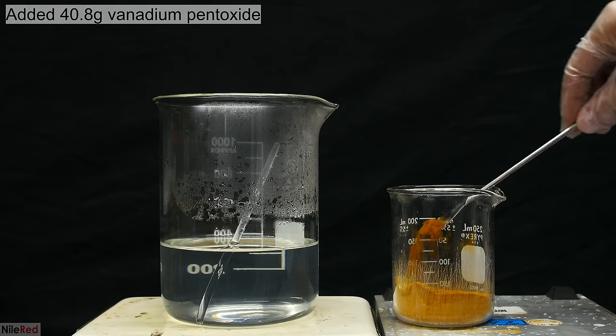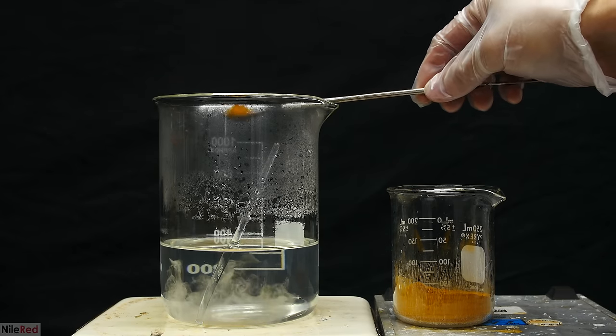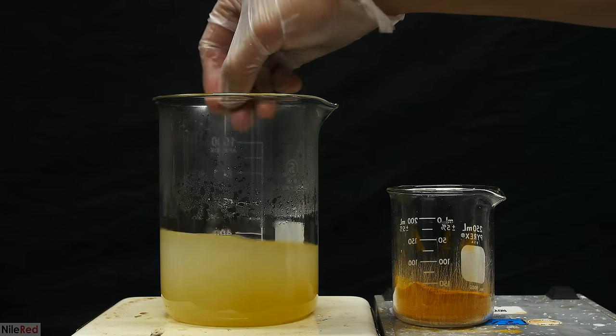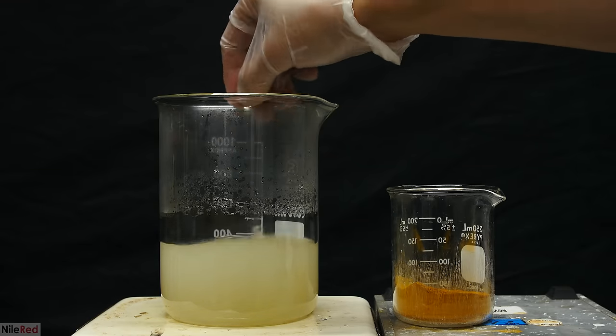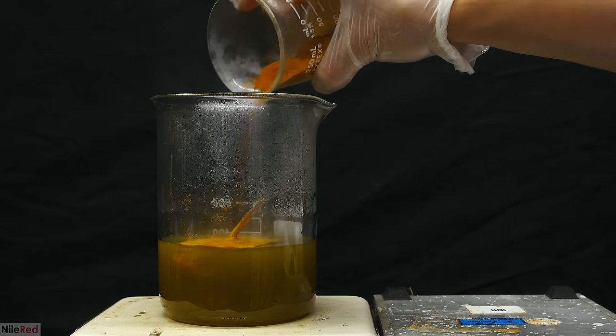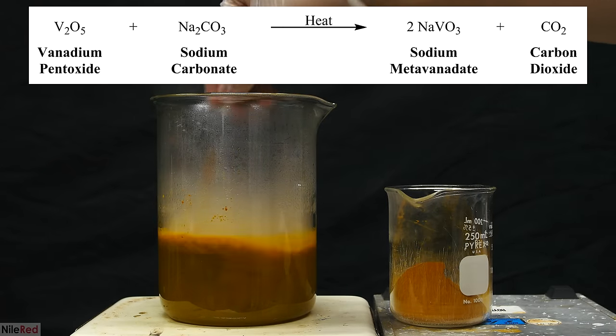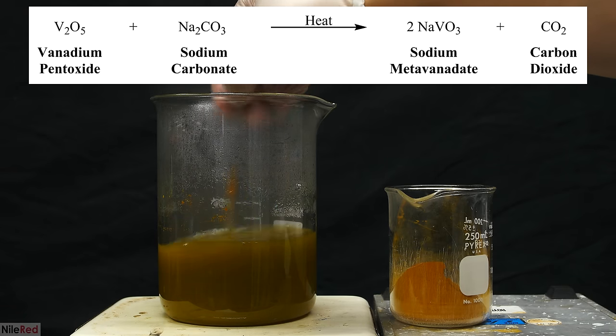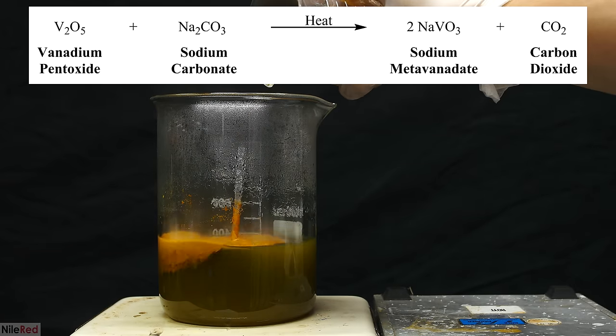Once everything had dissolved and we had our hot solution of sodium carbonate, it's time to slowly add the vanadium pentoxide. I really need to emphasize that it's important that it's added slowly because this reaction produces a lot of CO2 gas, and if we added it all at once or too quickly, it could easily bubble out of the beaker. The overall reaction occurring here is between vanadium pentoxide and sodium carbonate to produce sodium metavanadate and CO2 gas. This reaction only takes place at a decent rate in hot solutions.